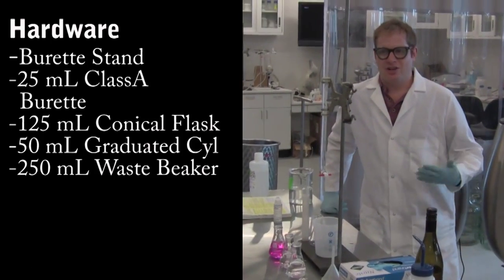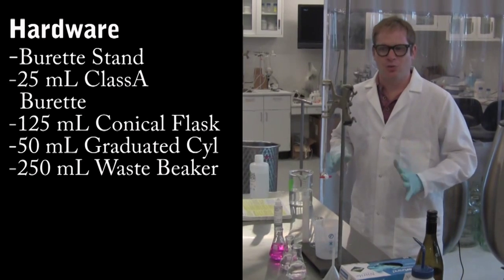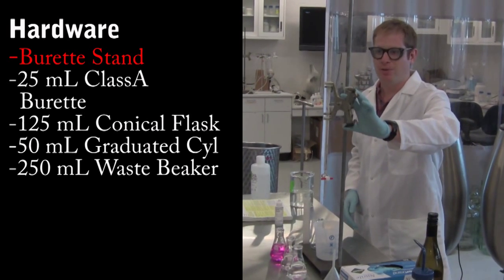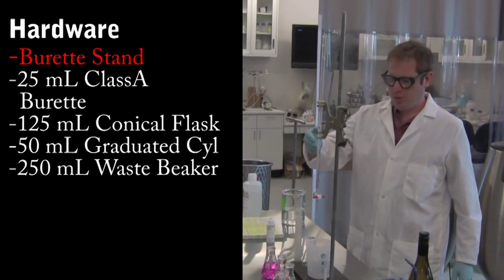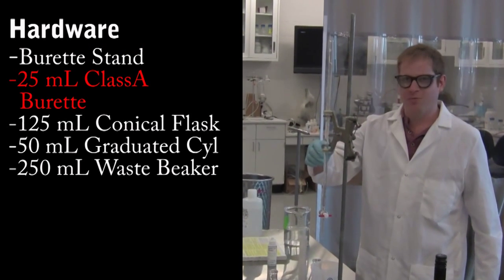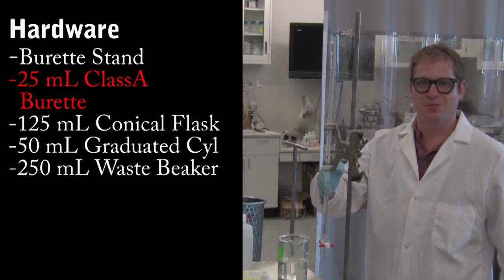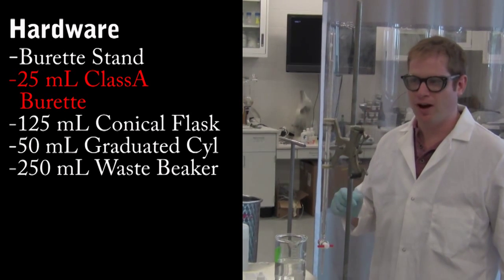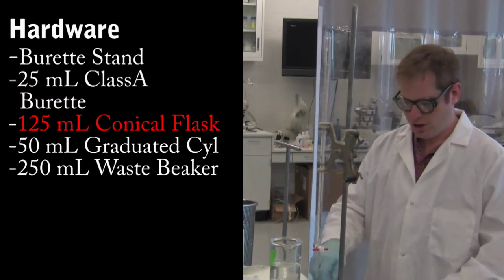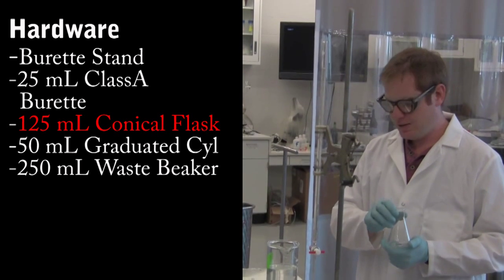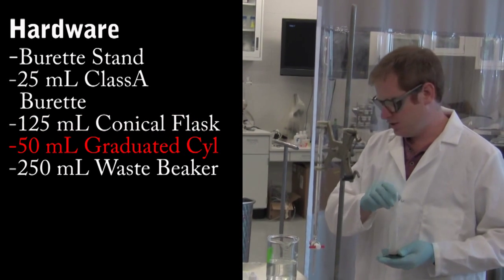Okay, what do we need to get started? Well, for the hardware, we're looking at a burette stand with a burette clamp, and a 25 mil Class A burette, accurate to .05 milliliters. We need a 125 milliliter flask, 50 milliliter graduated cylinder, and that should do with a waste bucket.